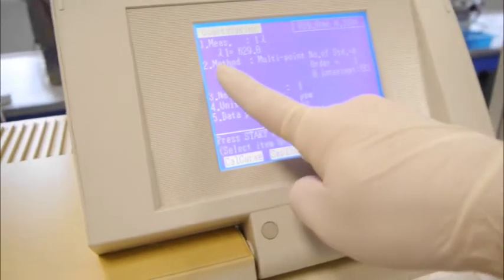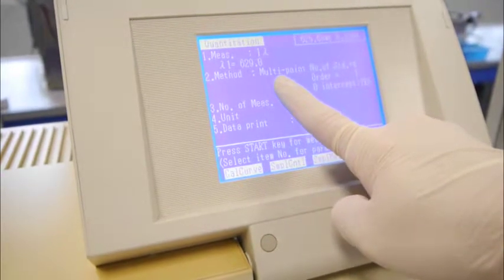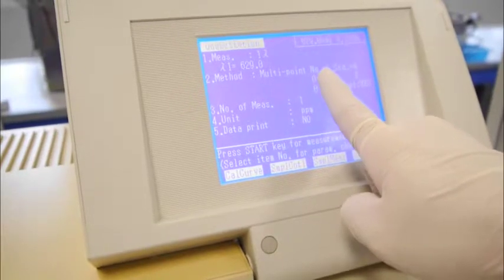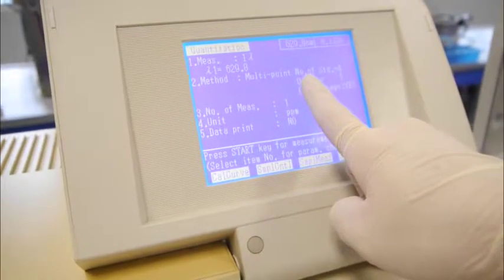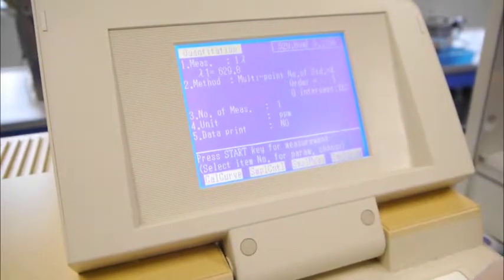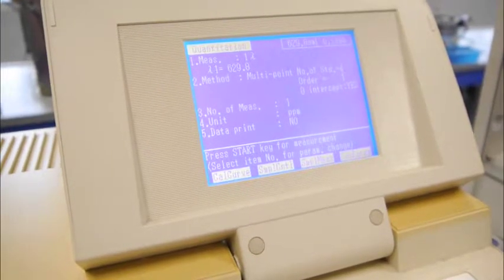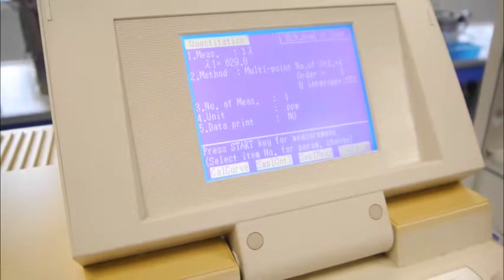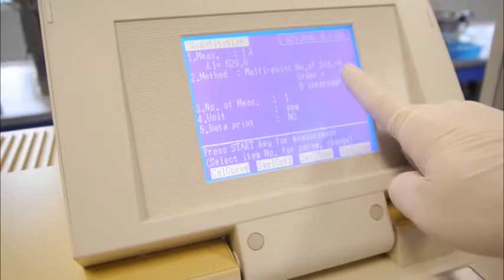After you have done that, under method which is item number 2, we will select multipoint calibration. There will be a selection of number of standards. For today, we have 4 standards including our zero blank, so no need to change — it will be 4 standards.